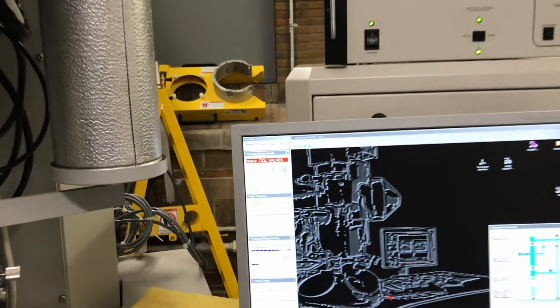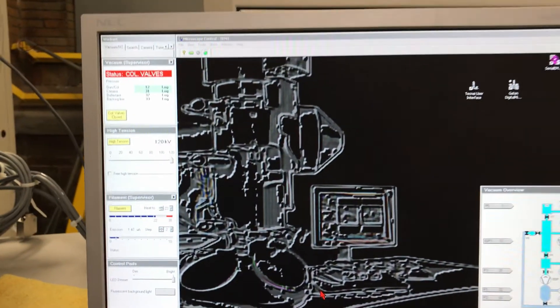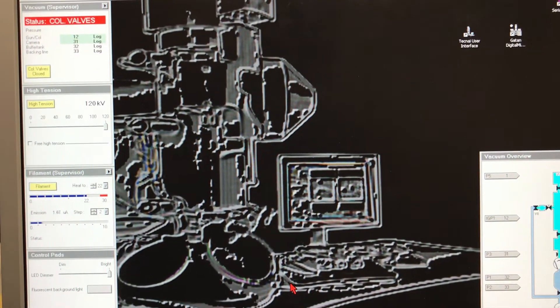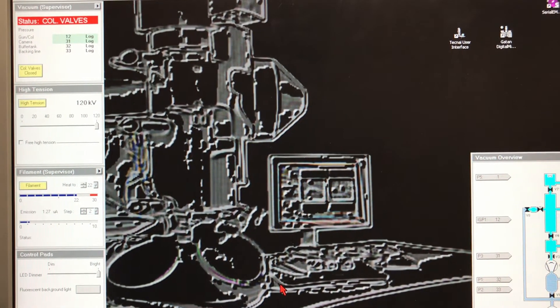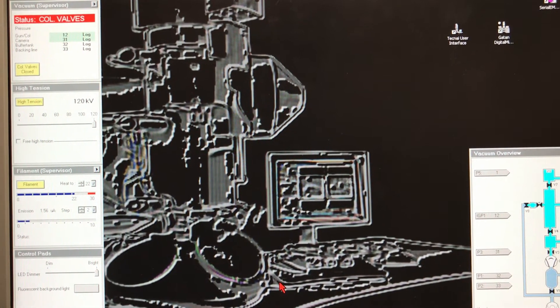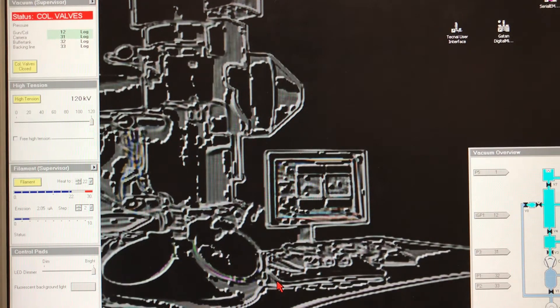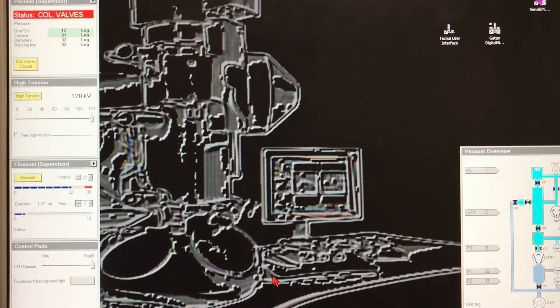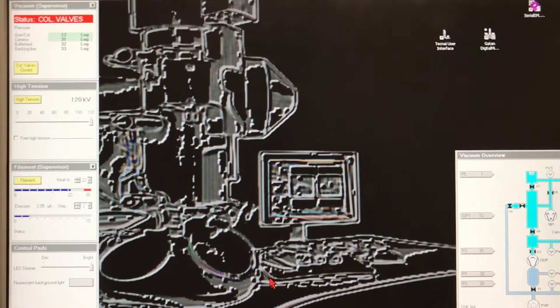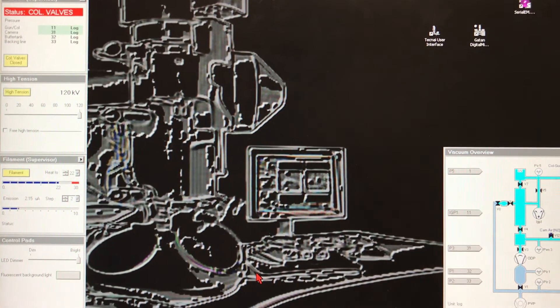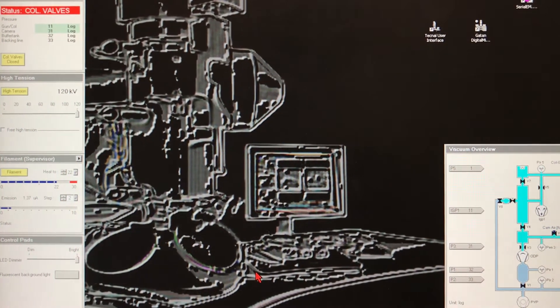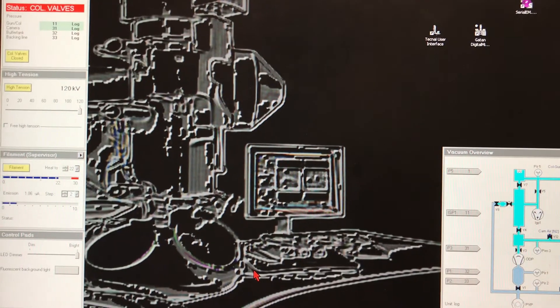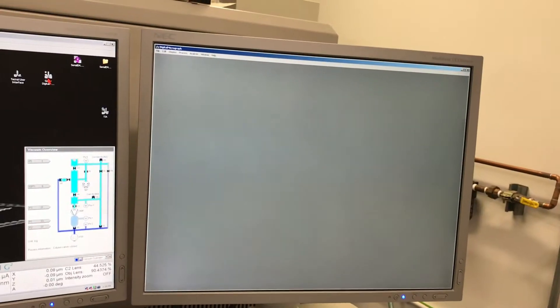Now you have to look back again at the TecNai user interface to check the vacuum values for the gun column. They will be a bit high, around 12, 13, or 14, depending on how gently you put the holder into the compute stage, and it will eventually drop to 6. At this stage we are ready to look at our grid.